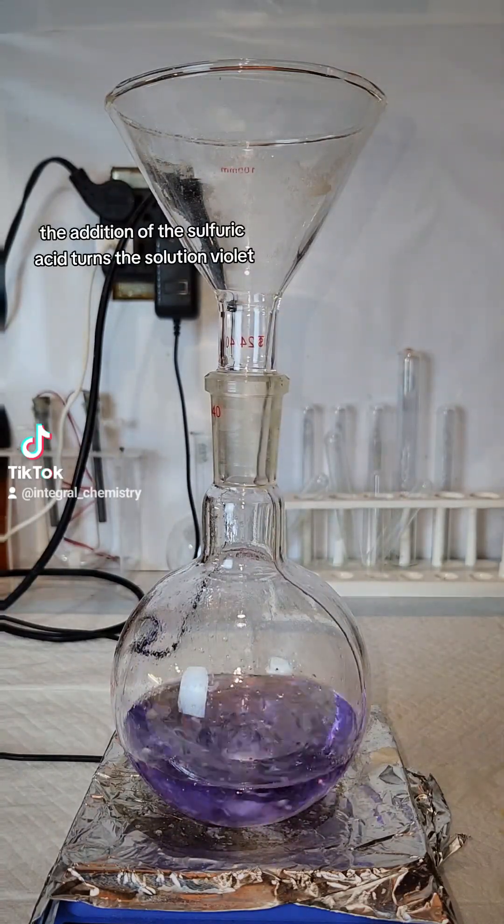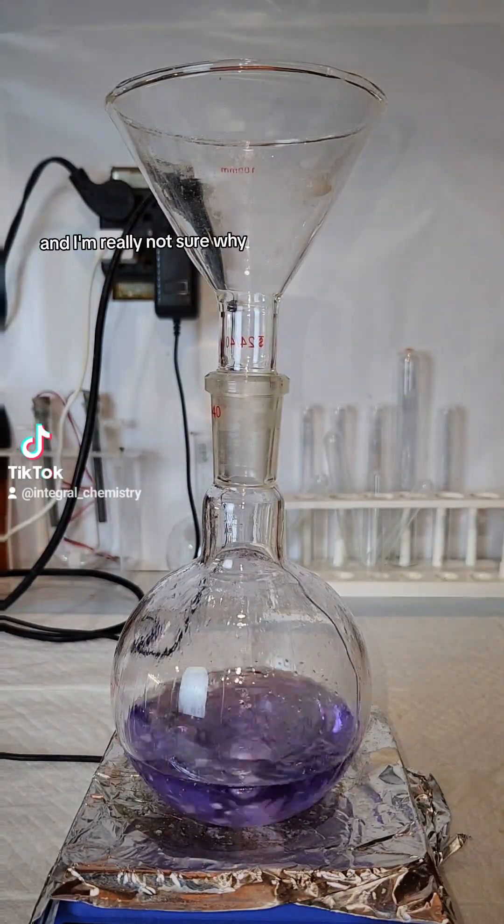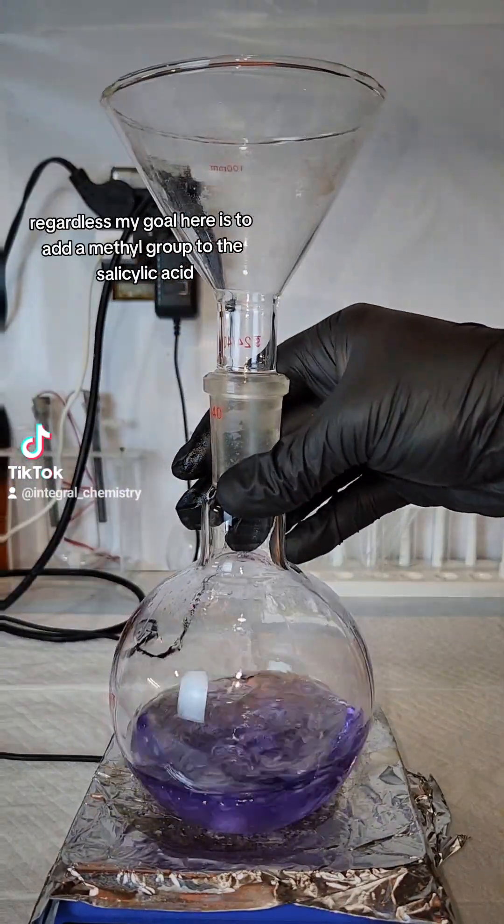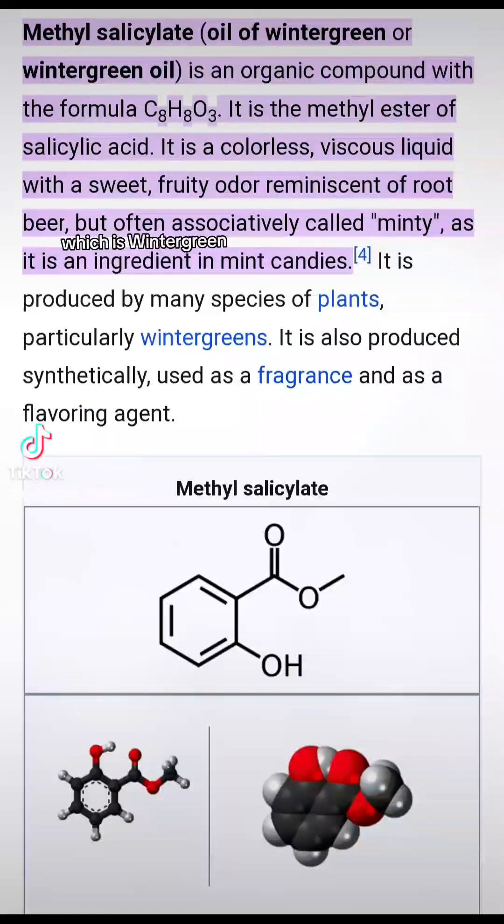The addition of the sulfuric acid turns the solution violet, and I'm really not sure why. My goal here is to add a methyl group to the salicylic acid and form methyl salicylate, which is wintergreen.